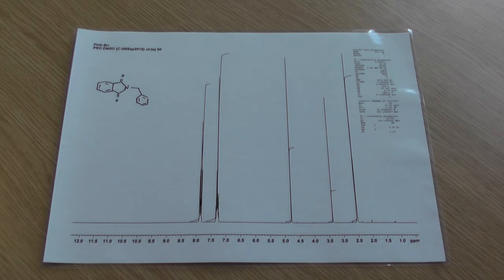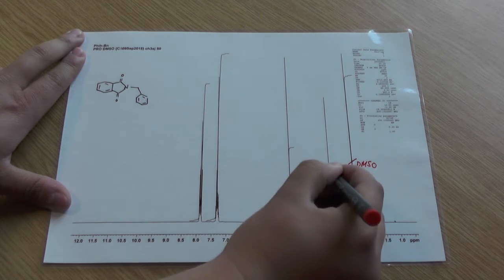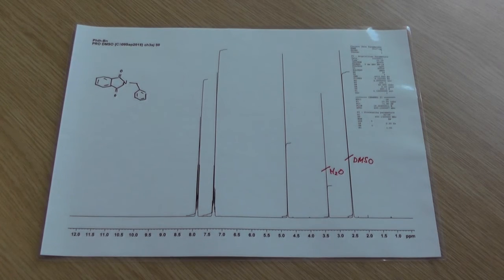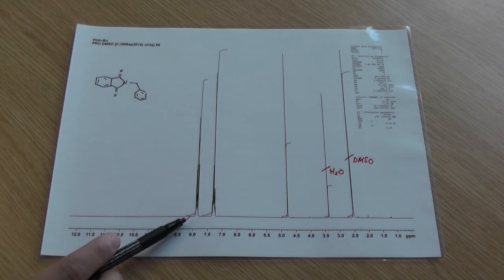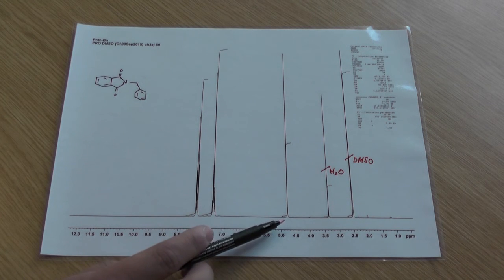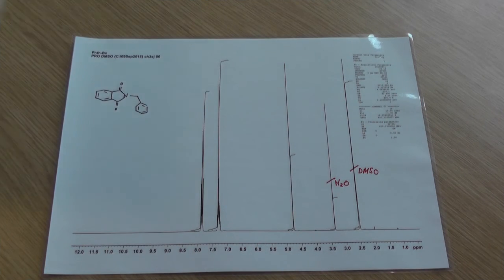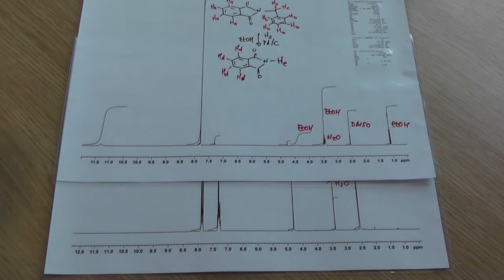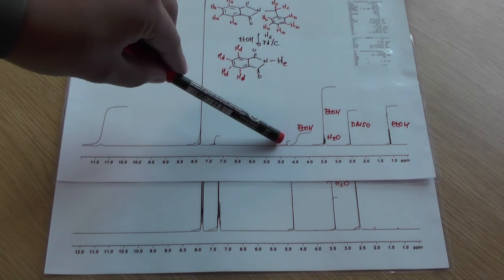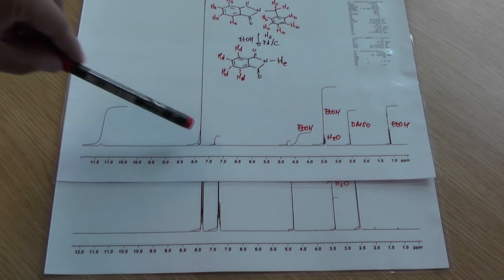You can see in the starting material we have a solvent peak from DMSO and a solvent peak from water. And then we can crudely assign the rest of the peaks and we can see that we have 9 aromatic protons and 2 aliphatic protons. Comparing the starting material NMR spectrum with our NMR spectrum, you can see that some of our small impurities come from the starting material. You can see the aliphatic protons from our starting material here and some of the aromatic protons here.